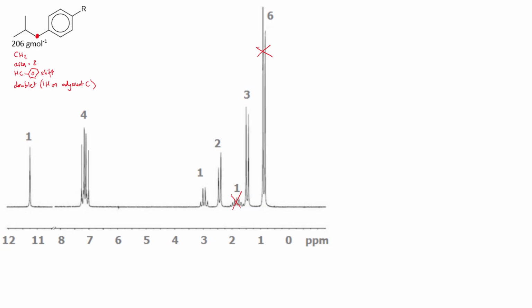on this carbon up here to the left, and there's no hydrogen, remember, on this carbon on the benzene ring. So just one adjacent CH, so it should be a doublet. So again, that all fits. So again, we have a peak assigned, and there it is. So those 3 peaks are now taken out of the reckoning. They're accounted for by the bit of structure we already know.